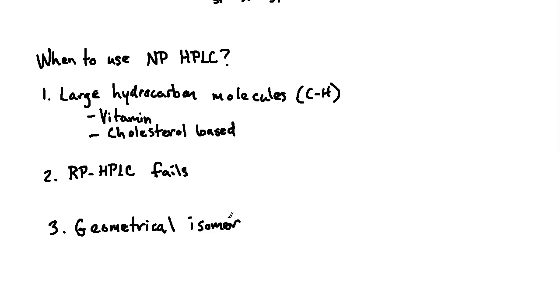So to give a kind of a sub-example here, right? Think of something like enantiomers, for those of you that have some background in stereochemistry, okay? So enantiomers are chemical molecules that are essentially going to be the non-superimposable mirror images of one another, right? And we know that this is important in the drug world.